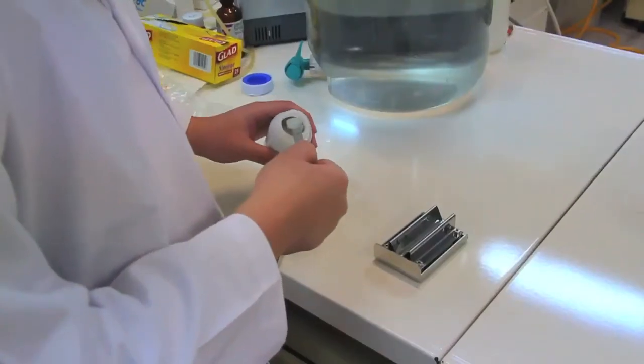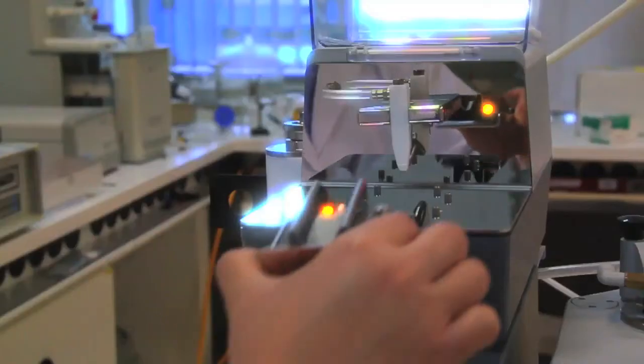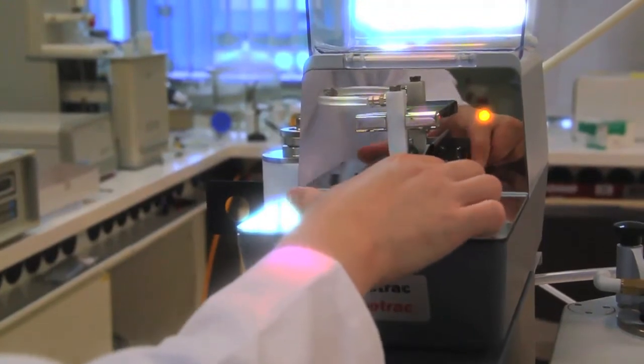To analyze a dry powder sample, scoop a small amount of sample onto the sample tray and place the tray onto the Turbotrack.